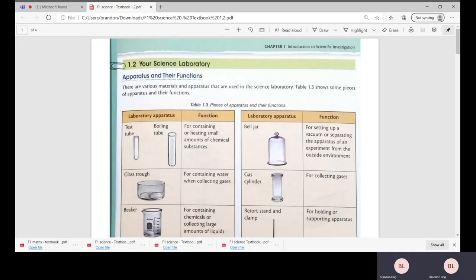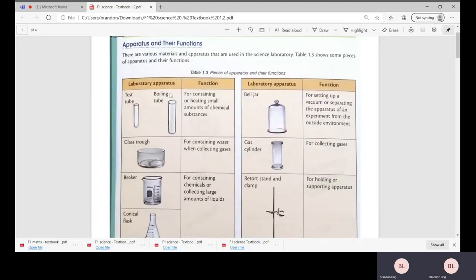On your left side you have the test tube and the boiling tube. Boiling tube is usually used for heating purposes, and test tube is used to hold certain chemical substances. Bell jar is for setting up a vacuum or separating the apparatus of an experiment from the outside environment.